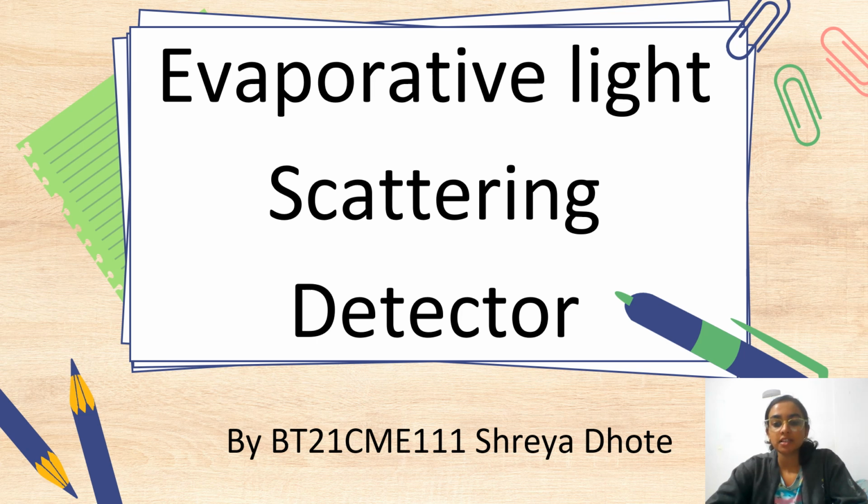Today I will be discussing the evaporative light scattering detector, which is also called ELSD, a type of detector widely used in liquid chromatography applications, particularly for non-volatile and semi-volatile compounds.